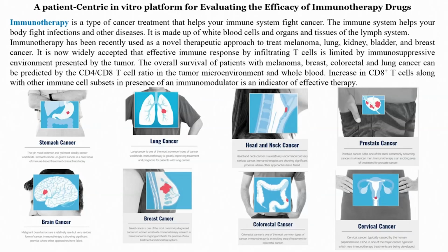So, what we see on the screen, we will be talking about a patient centric in vitro platform for evaluating the efficacy of immunotherapy drugs. Now, if you see several cancers right now, if you talk about stomach cancer, it is the fifth most common and third most deadly cancer worldwide.